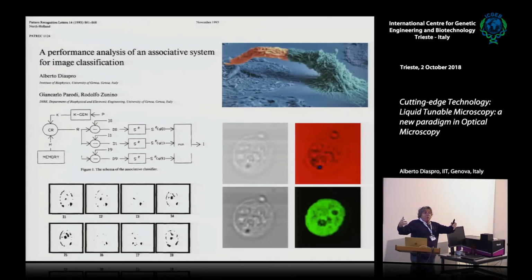The system, following your verbal description, getting information from literature, and the story of your sample and your question, decides which are the best image contrast mechanisms that you need for solving your problem. But at the very same time, while performing this kind of classical imaging, which can be super resolution, phase contrast, PET, X-ray, or whatever, it produces a fourth image. Point by point, in this image, are reported the data coming from all the investigation methods, mixed in a way not biased by the experience of the single expert in PET, X-ray, or thermography. At the end, with this image, you go to the doctor, and the doctor tells you, now I clearly understand what you have.